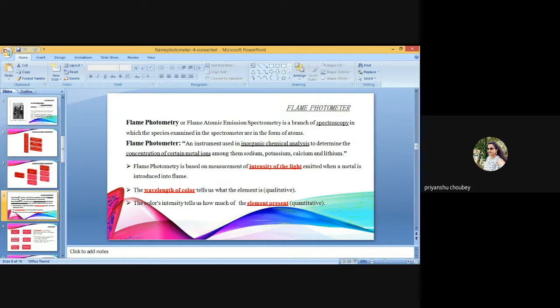Do not look at the flame without the aid of safety glasses or the flame shield. Do not leave the flame completely unattended. Do not ignite the flame if the airflow is below 7 or 6 flow units.